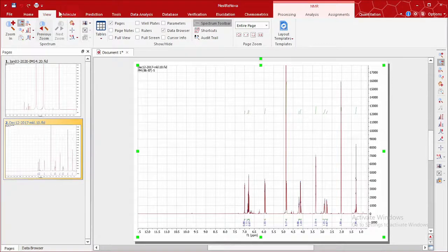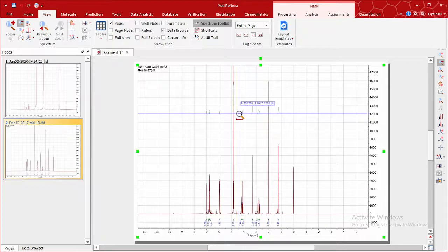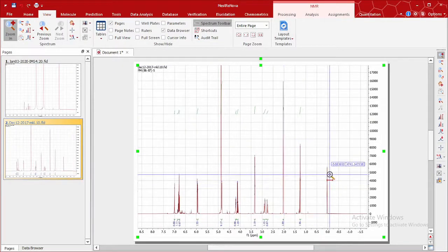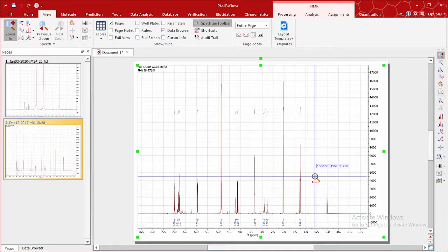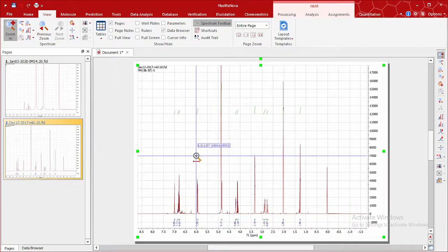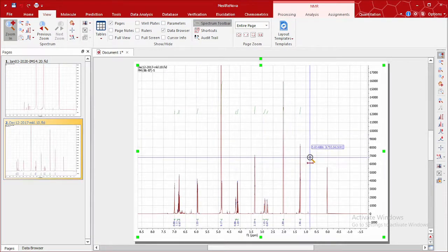Okay. So after the integration, let's zoom out back. We're going to be looking at multiplet analysis. The multiplet analysis is all about multiplicity. We are going to tell MestreNova to give you the multiplicity of each of the peaks. The multiplicity is defined as the number of lines seen in a chemical shift. It tells you how many hydrogen atoms are attached to a neighboring atom, and it takes the average of each peak and assigns their multiplicities.